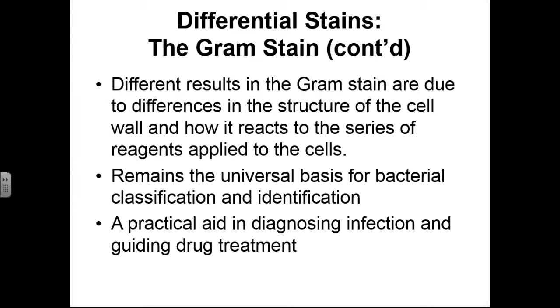The gram stain is one of the gold standards in bacterial identification. When you're talking about a human being, you talk about vital stats like age, weight, gender, hair color, eye color, the vital stats you see on your driver's license card. If we were to make a driver's license card for a species of bacteria, like E. coli or Clostridium difficile, one of the things you would include on that is whether it is gram-positive or gram-negative. Gram staining is one of the vital stats for bacteria.